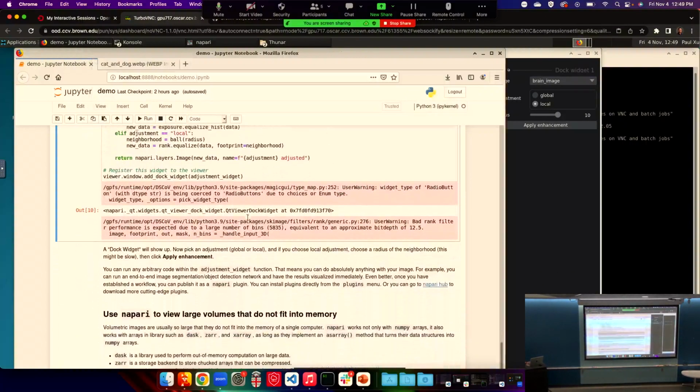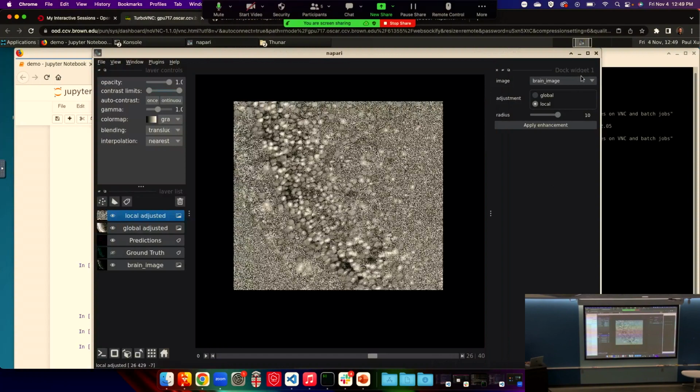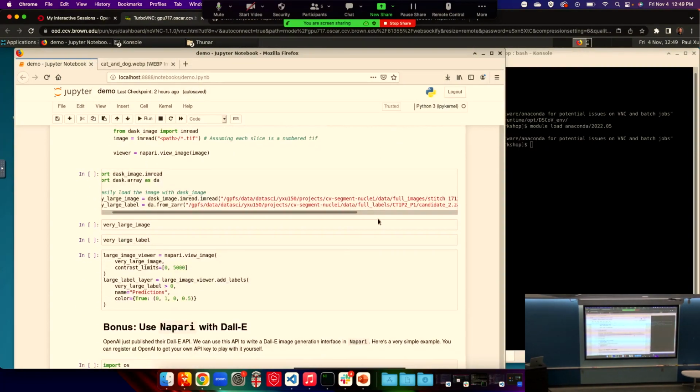So yeah, that basically ends my presentation about interface customization. Any questions right here before I move on to the next section, which is also pretty cool? All right, okay, so let's move on. Let me just close this. And the task right now has changed. Okay, yeah, please go ahead.